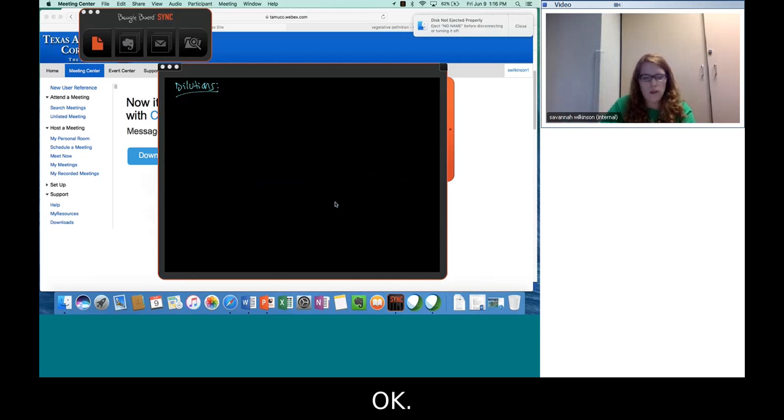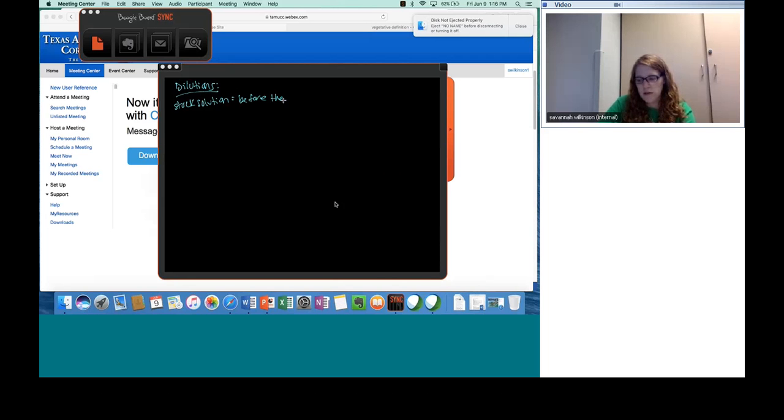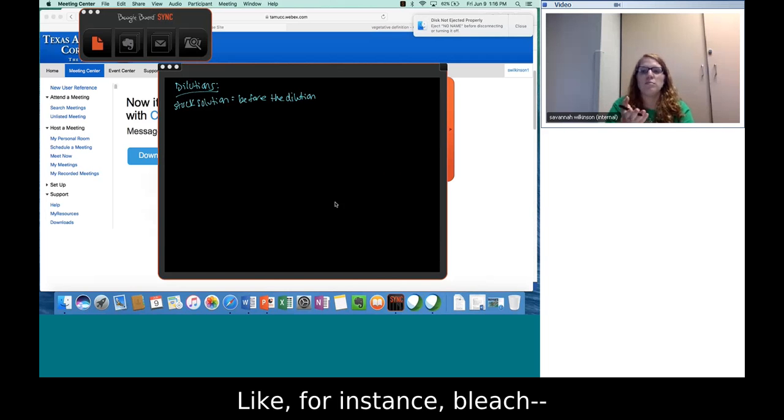Okay. So your stock solution is basically before the dilution. And whenever I say dilution, it's like you're making something less concentrated. Like, for instance, bleach.